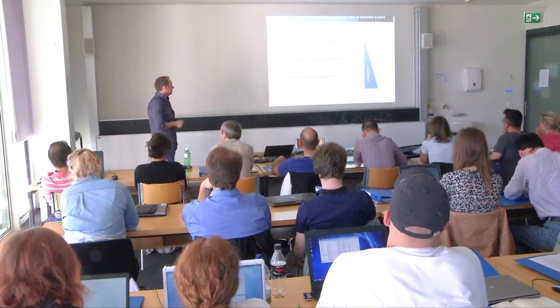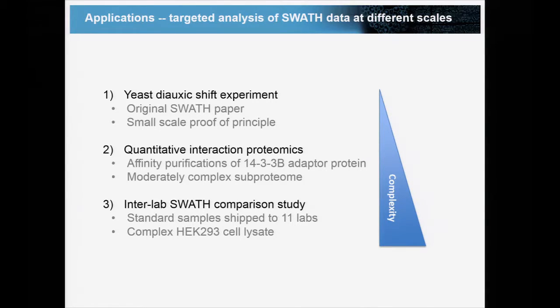So now I want to look briefly at a few applications. And I've listed what they are, and the point is not to tell you anything about the biology of these particular applications. I just thought it's interesting to look at the different scales at which this type of analysis can be done. So the first one is actually in this original SWATH paper from Ludovic.